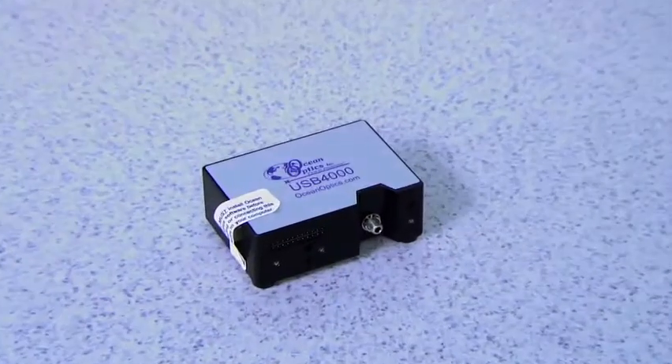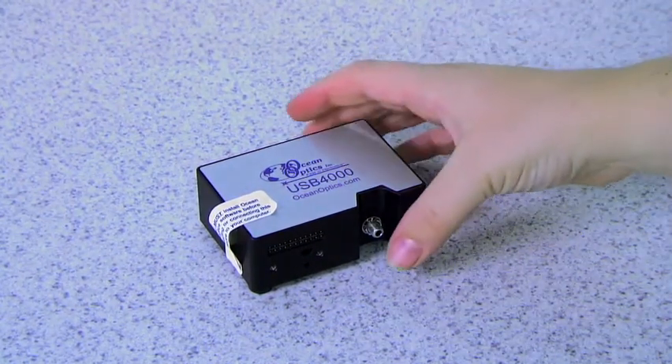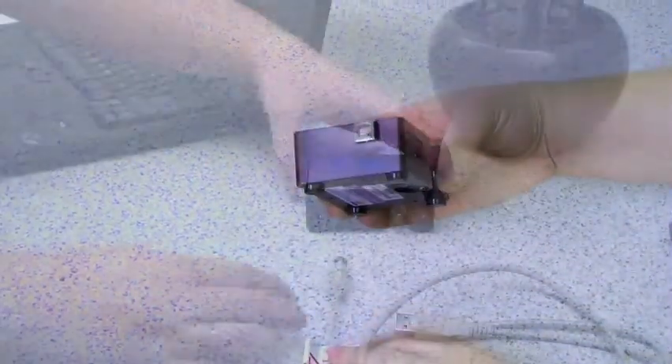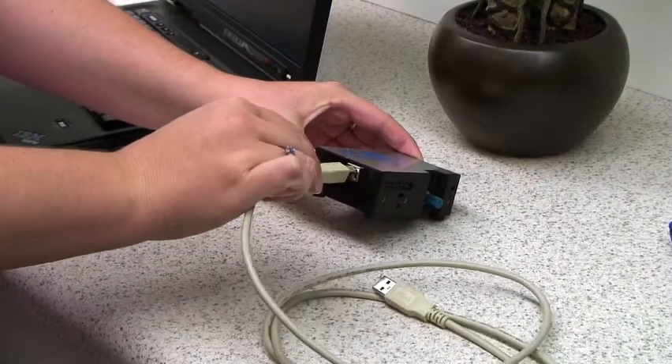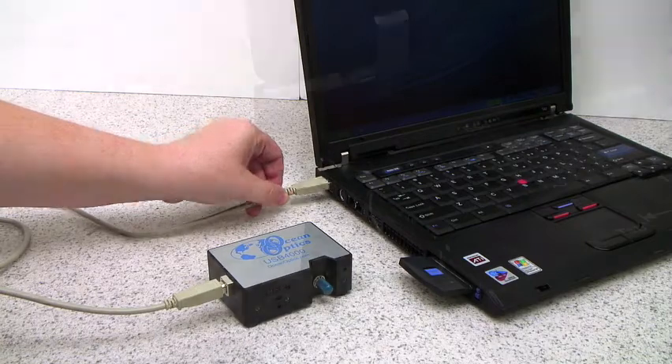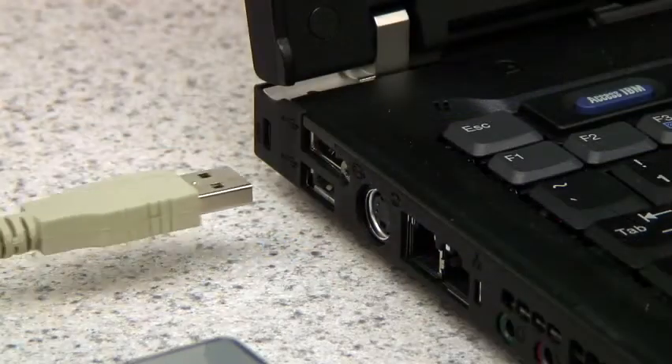You will see a white sticker over the USB port on your Spectrometer. Go ahead and remove the sticker. Now connect the USB cable to the USB port on your Spectrometer. Connect the other end of the cable to the USB port on your computer.